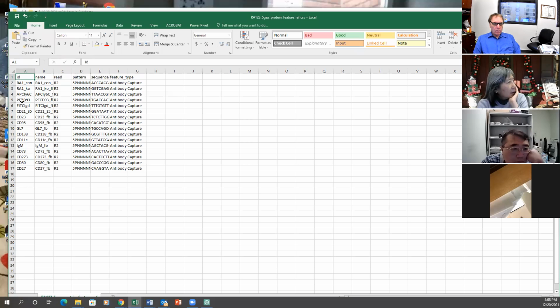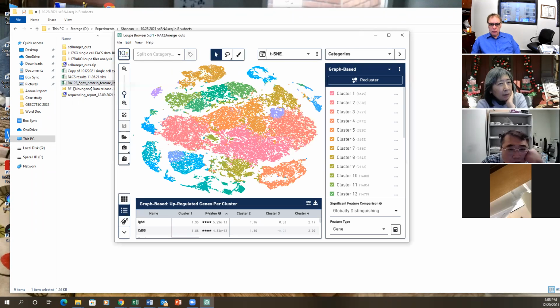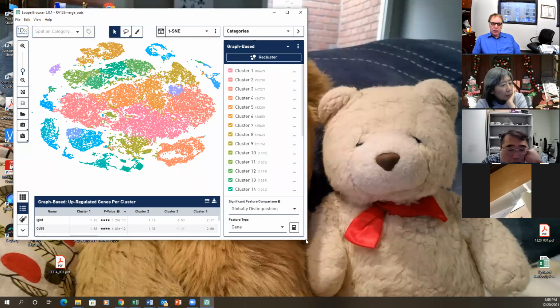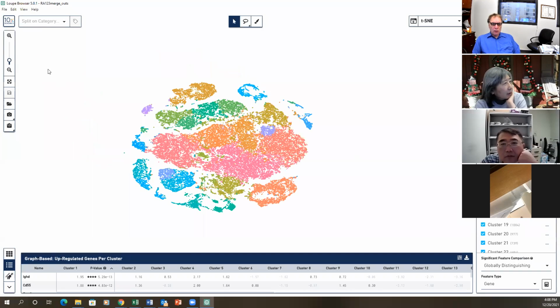Yeah, this is the Mingau's code. So we need that's RE1. So this is the file. Right. Is that B cells? Oh no, it's not pure. No, it is. All sampled together in one file. Oh, right. Okay.